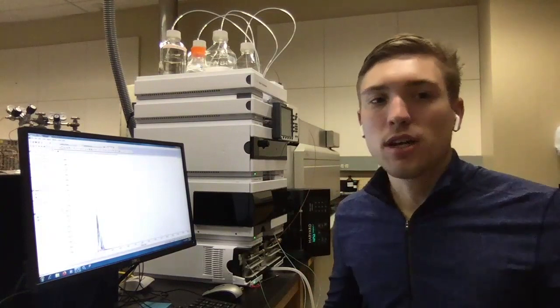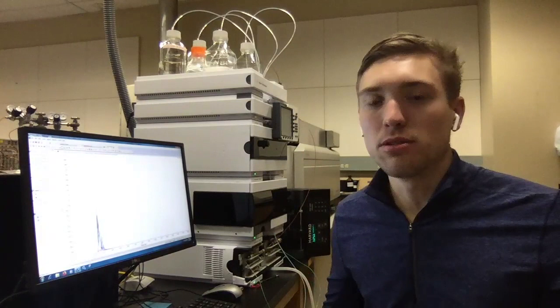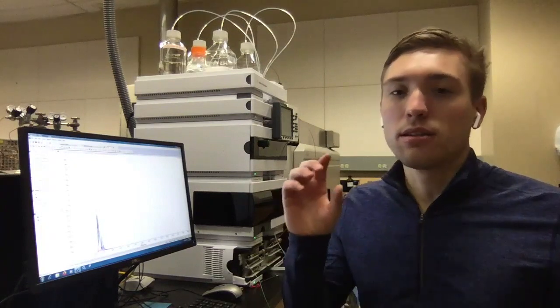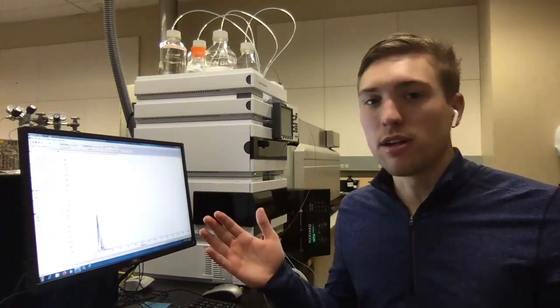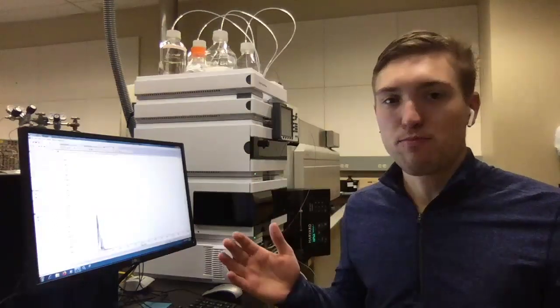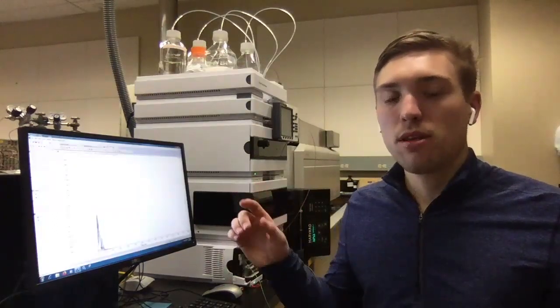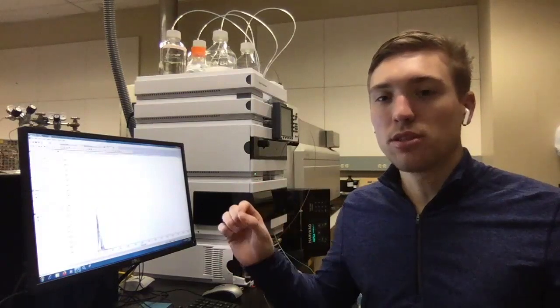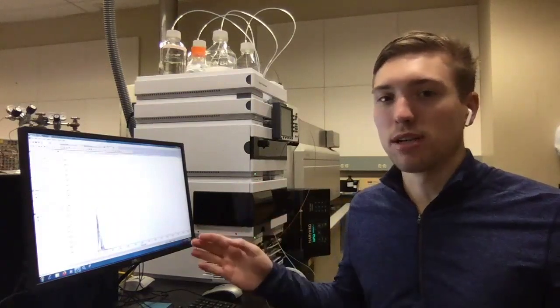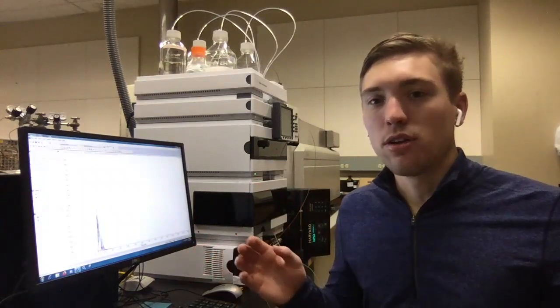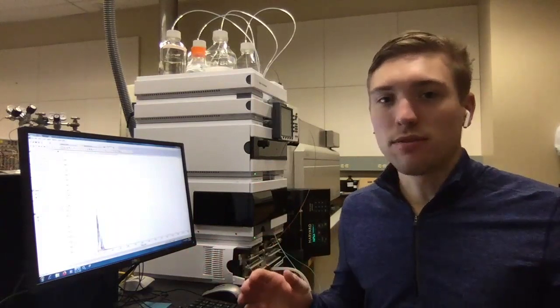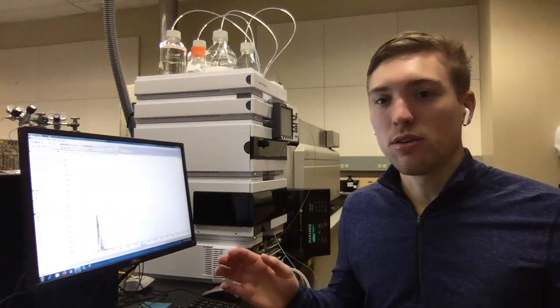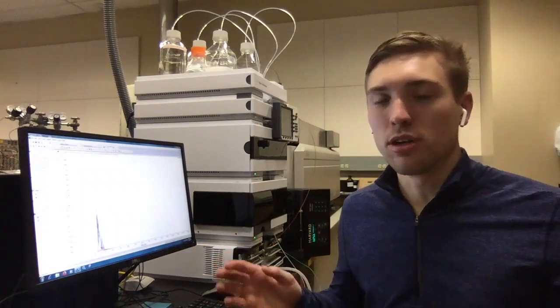First off, the enhanced mass spectrometry mode is what you'll probably be using most of the time. And that mode uses all three quadrupoles, and it can scan over a range of masses that you feed into the instrument over the entire chromatographic method. So this will give you a chromatogram that you can select a certain range of and see what masses are present. This is really valuable if your analytes are in high enough concentration and or you aren't really sure what your M over Z values are of your analyte.